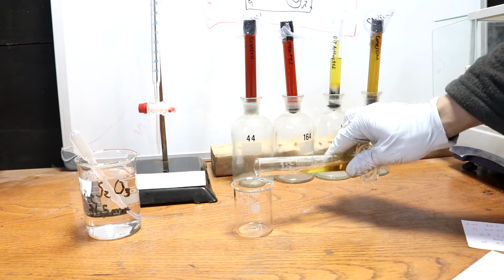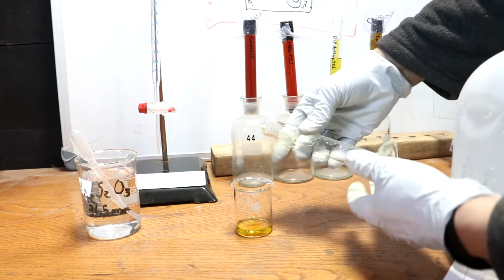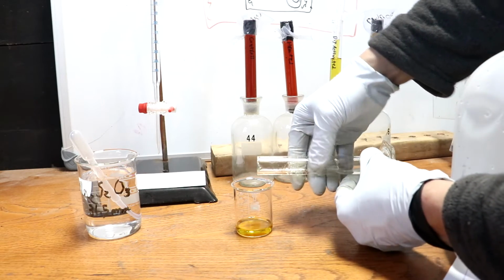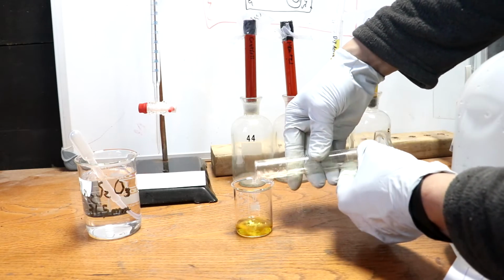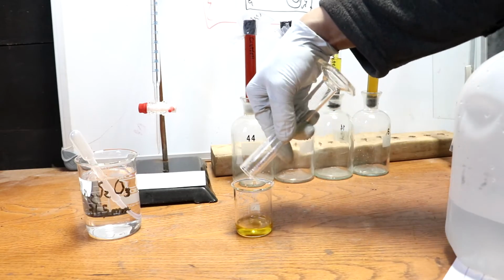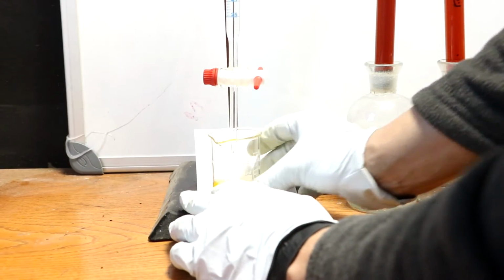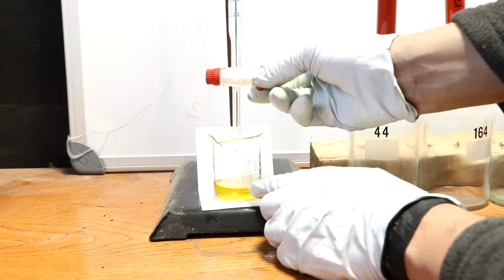I'm going to transfer this over to here. Rinse it with a bit of water. Concentration here doesn't matter, it's the amount of iodine in 10 milliliters, so I need to make sure I have the 10 milliliters of the iodine solution. Okay, the burette is full. Let's put that under it. Begin the titration.